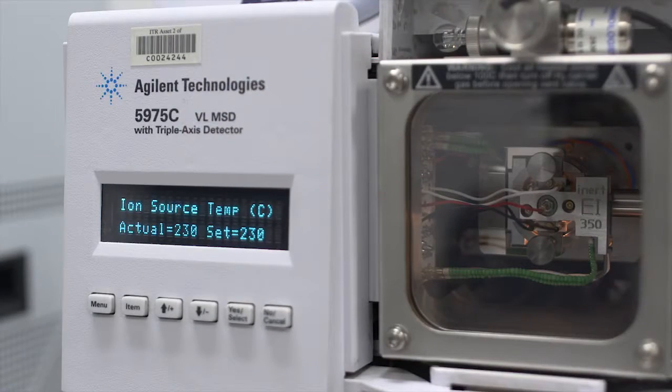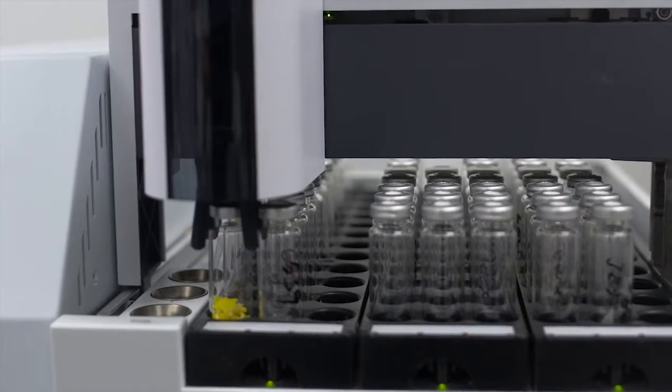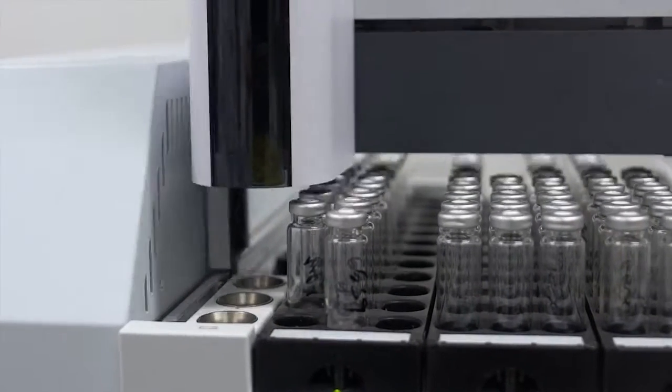Hello, my name is Sebastian Barone. I'm a senior analyst with the National Measurement Institute. We analyze for volatile organic compounds, that is VOCs, using an Agilent 7890 GC coupled with an Agilent 5975 single quadrupole mass spectrometer with both an Agilent 7697A headspace sampler and a Tecma purge and trap sampler.